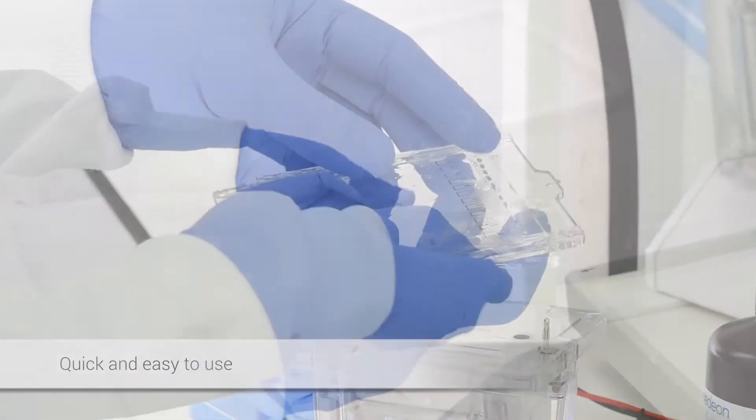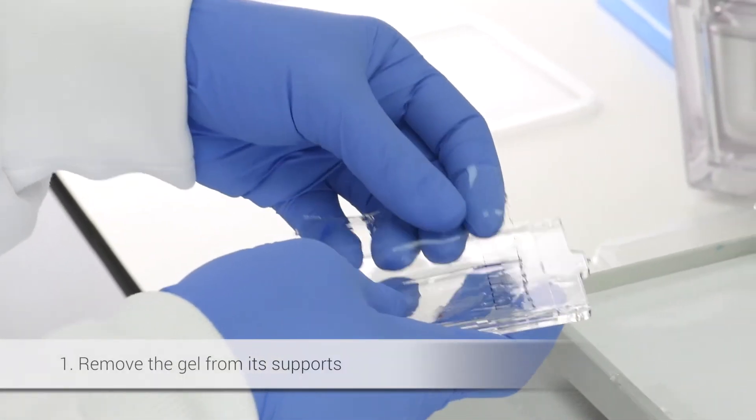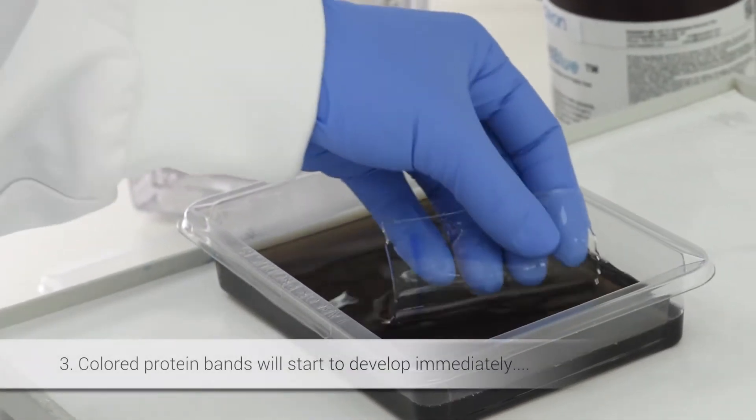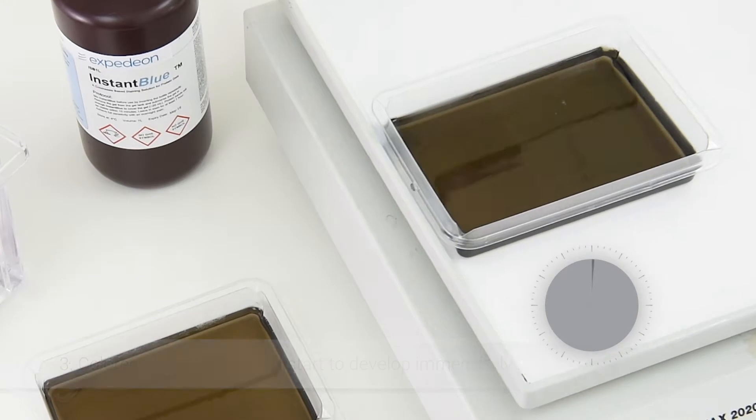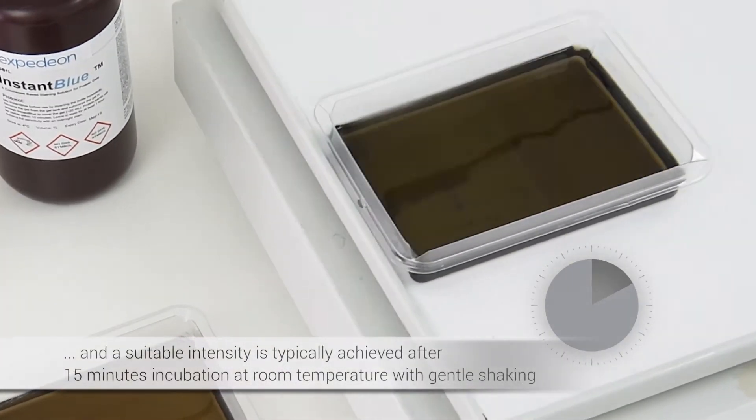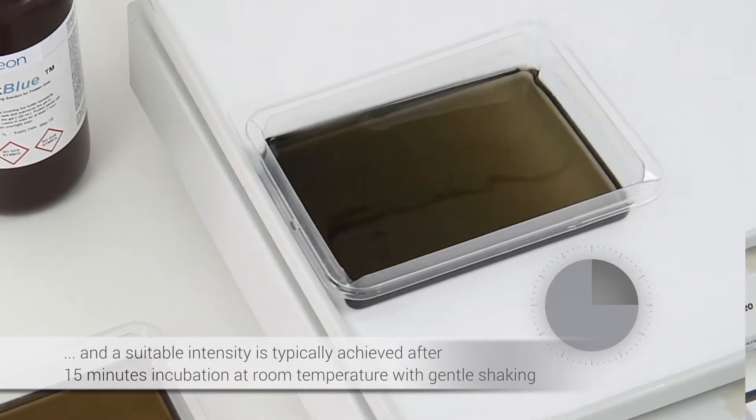InstantBlue is quick and easy to use. Remove the gel from its supports and add the gels to the InstantBlue solution. Colored protein bands will start to develop immediately, and a suitable intensity is typically achieved after 15 minutes incubation at room temperature with gentle shaking.